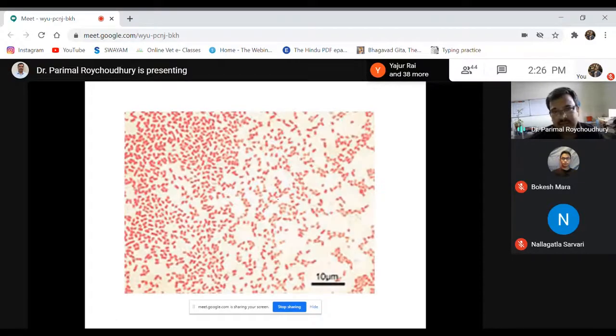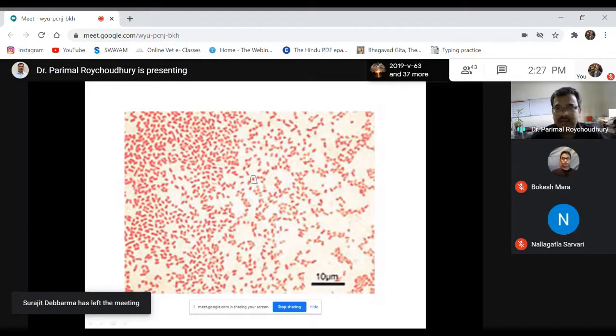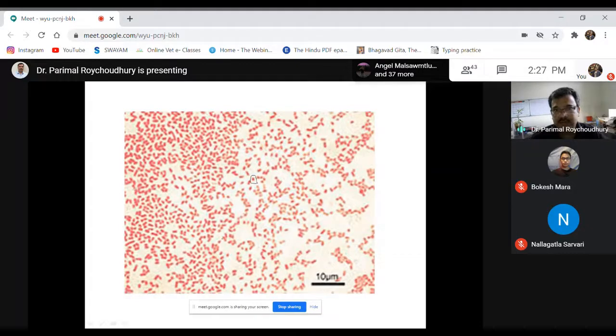Here, they have taken only one kind of stain, probably carbolfuchsin, and all the bacteria are taking the same color. We can see very small bacilli. Sometimes the bacilli are so small that their length and width are almost the same. We call them coccobacilli. So likewise, there are many. These are coccobacilli, where the length and width are almost the same. But this simple staining cannot provide more information about the type of organism. Only the structure you can study.